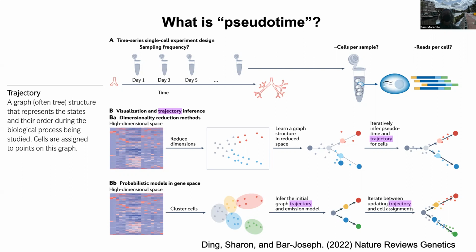I was interested in running that algorithm, but it came out around the same time as a lot of these ones, like 2019, and they had a massive data set. For back then, they had 300,000 or 400,000 cells, which is larger than most data sets back then. And it was not clear to me if you could run it on fewer time points. I think they had 6 or 7 time points.